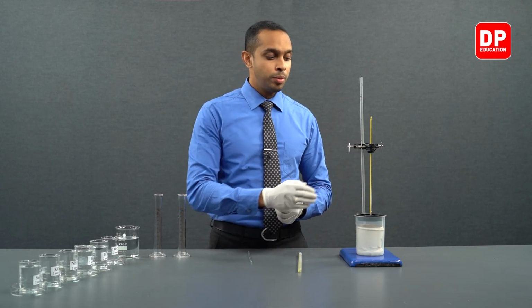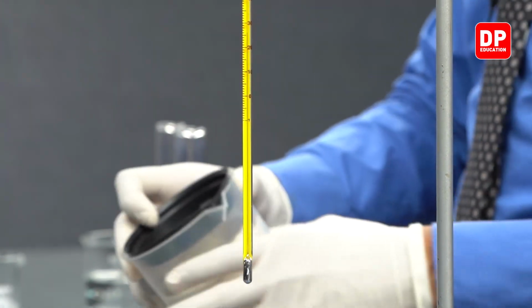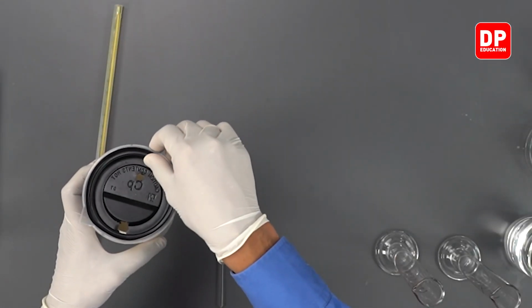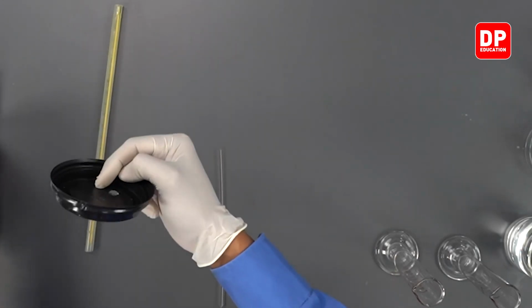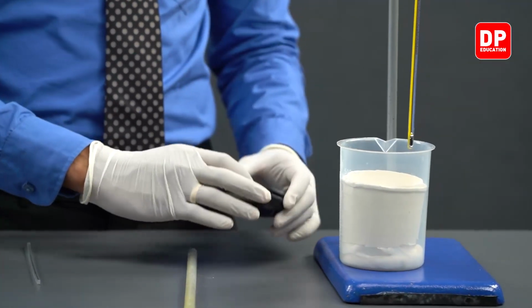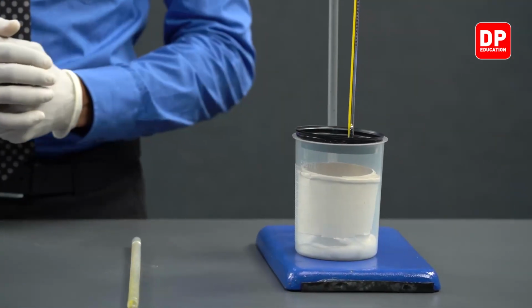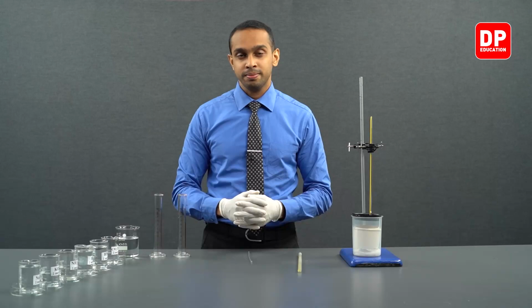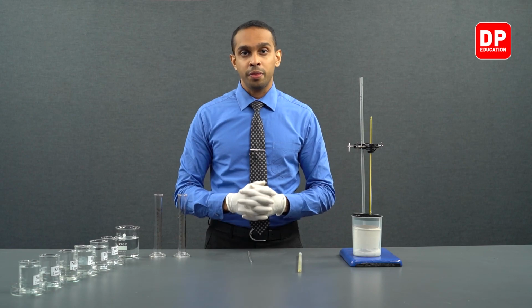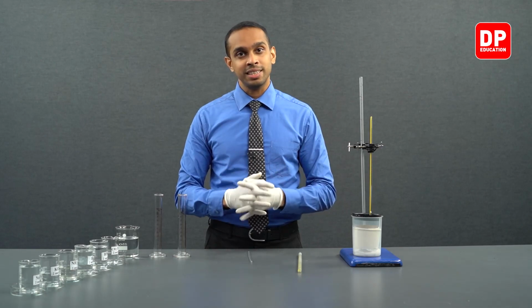Apart from that, we will be using a thermometer that is directly included into this setup. We can see we have a lid here, and there's an opening. Through these openings in the lid we will be inserting our thermometer, and we have set up our thermometer on a retort stand. These are the equipment and our reagents we will be using for this experiment. Now, let's move on to actually conducting our experiment.